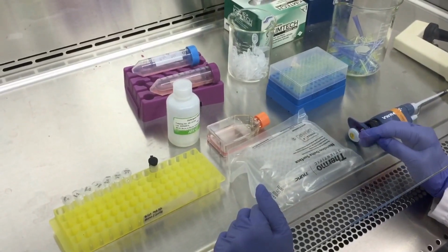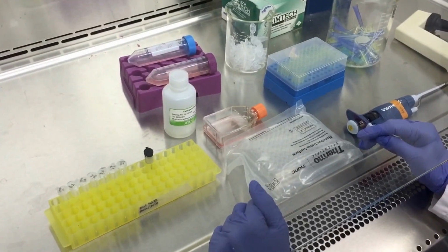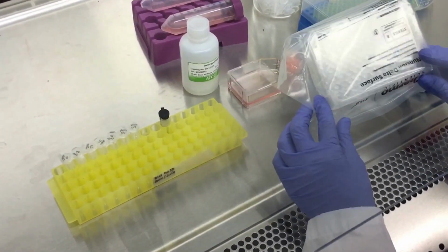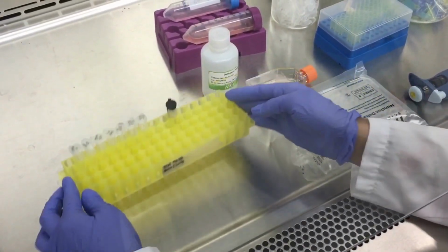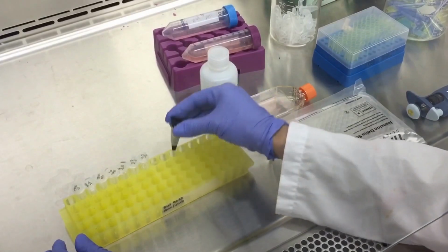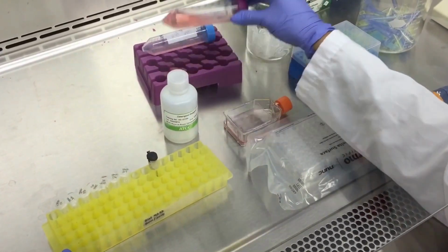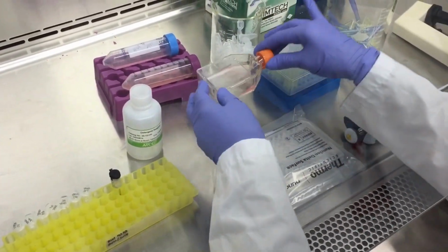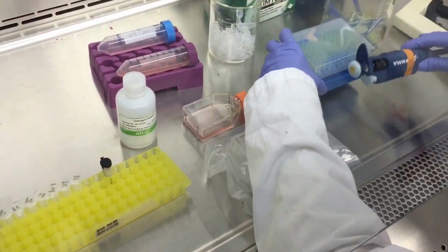Hello, today we're going to show you how to do MTT assay on suspension cells for screening compounds. For this experiment, you would need a 96 well plate, your compounds that you'll be testing, MTT, detergent, media, your cells, various pipetting tools, and pipette tips.